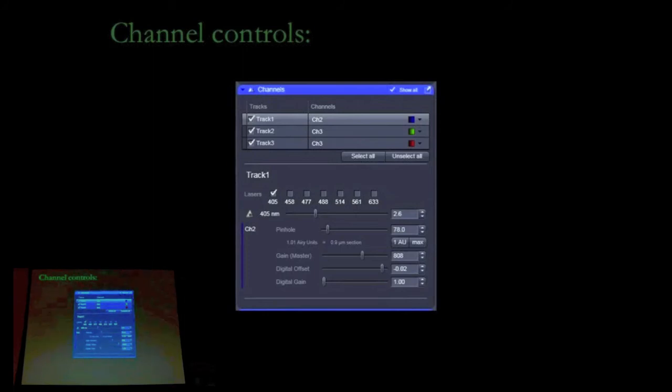With a spinning disk, the pinhole size is going to be matched to a particular objective NA, and so the system is going to be designed to work with that specific objective. And if you move away, so changing your NA would do it, but yeah.